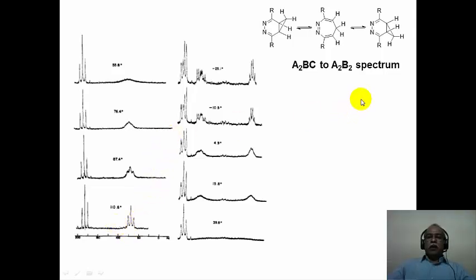Now when the molecule is actually in a frozen state, when the rearrangement is considerably reduced at low temperature, at minus 25 degrees for example, what one sees is a second order A to B C kind of a system, which is fairly complicated. This is an A to B and C kind of a system, and in between temperatures of course you have the uncertainty principle kicking in, and as a result of that, broadness of the signal is what is seen in the molecular system.